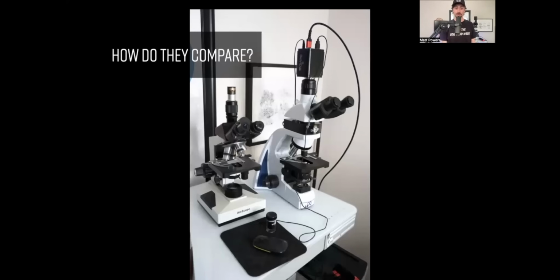The one on the left is the one that you're talking about, the bright field. That's what everyone knows. That's the thing that people are trained in, until me and my work, and it's because of the one on the right. The one on the right is special. If we think of it as a cheeseburger, or a hamburger or something like that, do you see it sandwiched in between the two things? That is the special part. And that camera on top is pretty handy as well.